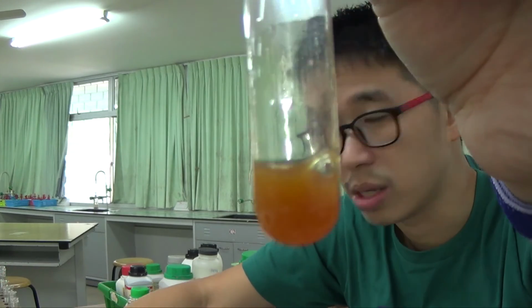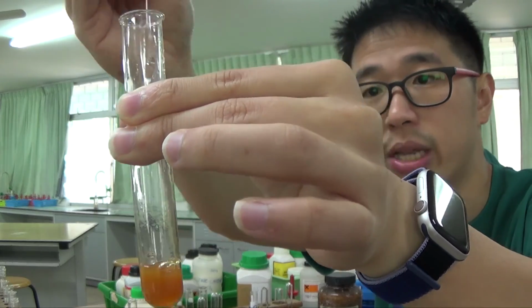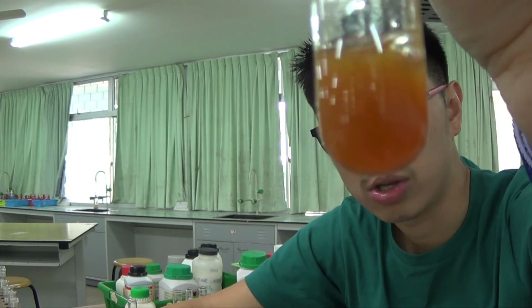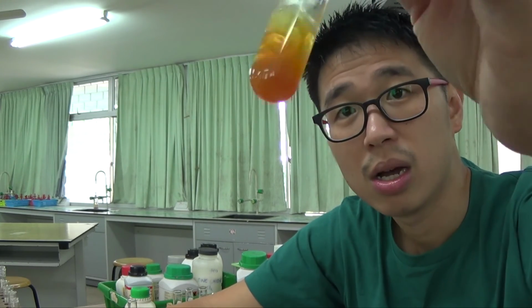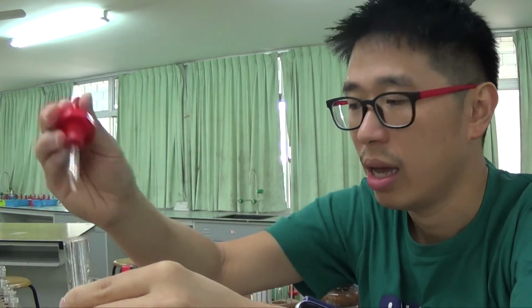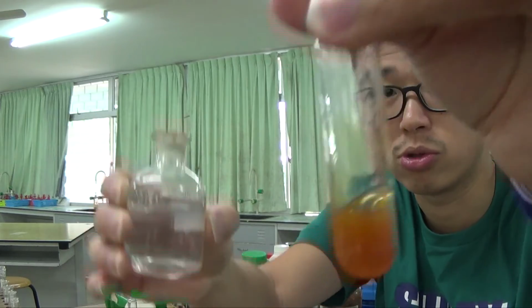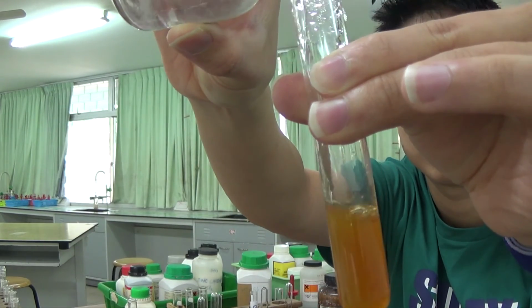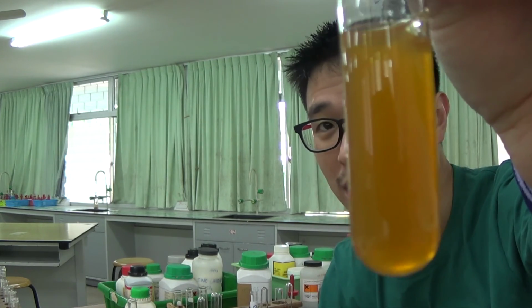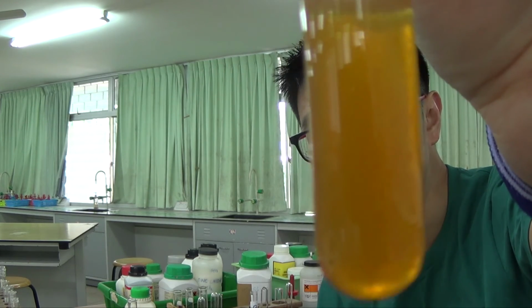Just now it was a solution. Now you cannot see through it because it has formed a precipitate. So be careful what is a solution and what is a precipitate. You cannot see through anymore, because you get what looks like a reddish brown PPT, and this is with iron 3+. Now, this is what happens when you add a few drops. What happens when you add excess ammonia? This is still a precipitate, because even though it looks like it has dissolved, can you see through it? If you cannot see through it, you cannot see me, right?